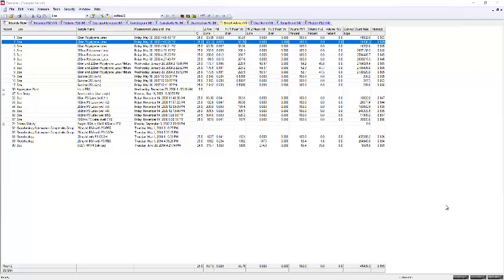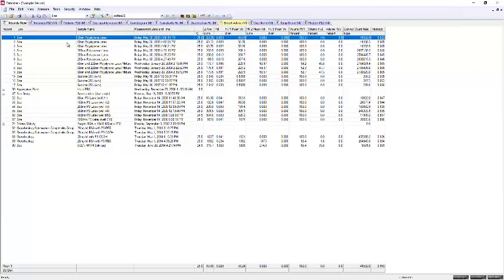This is a quick introduction to the Zetasizer Nano Series software, specifically designed for our most popular system, the Zetasizer ZS. There are many ways, once you get a result, to export the data. As you see here on the record view, I have a lot of different parameters that I have actually customized that I would like to maybe put into a table, into maybe Excel.